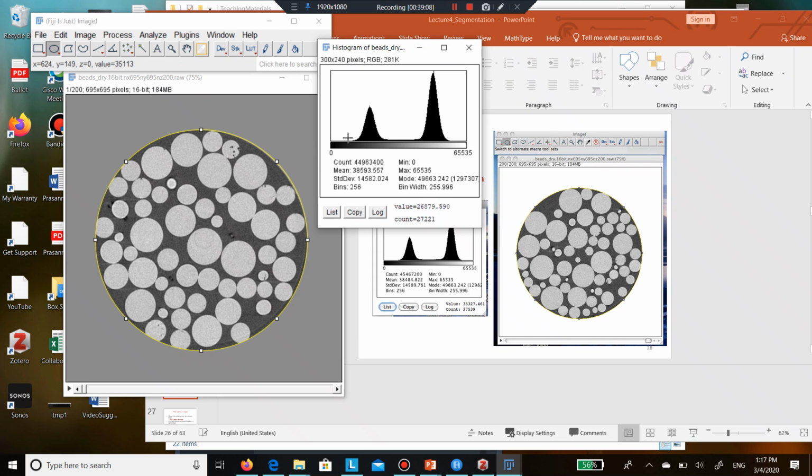So these are two well-separated peaks. They don't sharply go down to 0, but wherever I put the threshold, this is not a lot of pixels. Even if I do log scale, you can see they show up only on log scale. So whatever error I have in choosing a threshold, whether I choose it here or here or here, that will definitely have some effect on the porosity I calculate, but it's not going to be large when I divide by the total number of voxels.